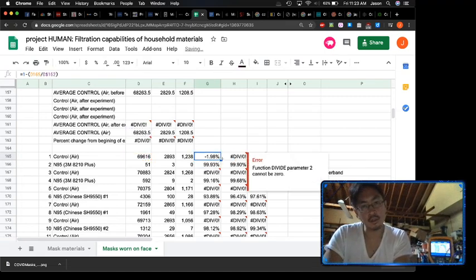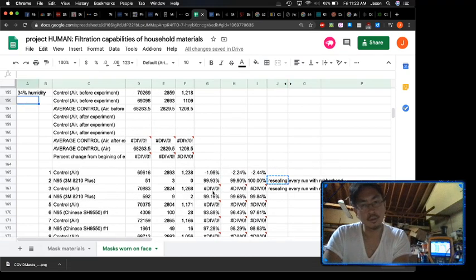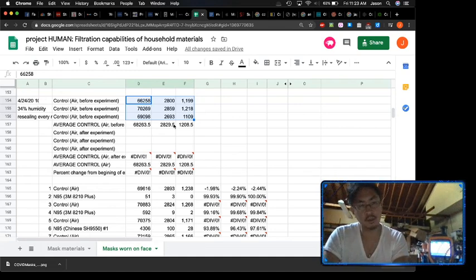So I'm just going to set up my worksheet again. Oh shit, I'm going to take some controls for the end of the experiment, which I will use for the beginning of the experiment of this one.